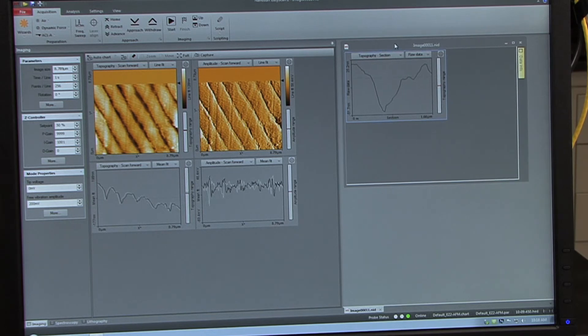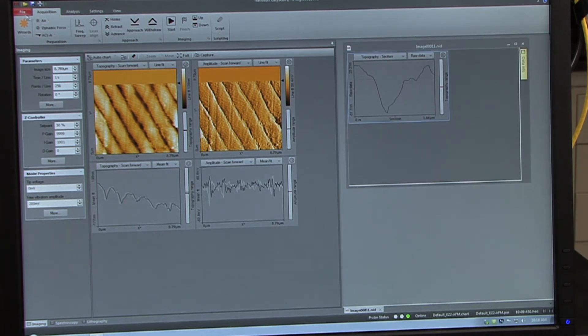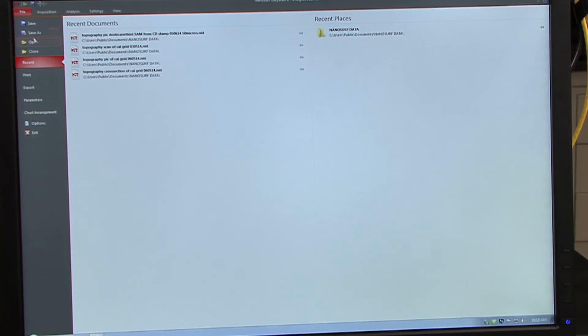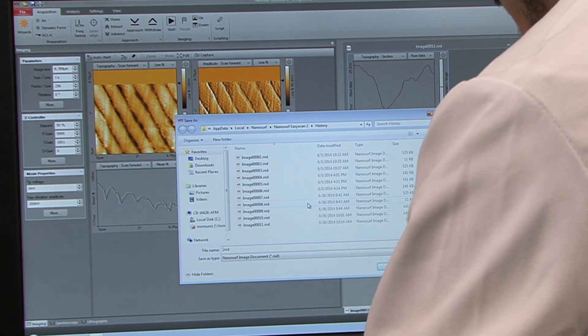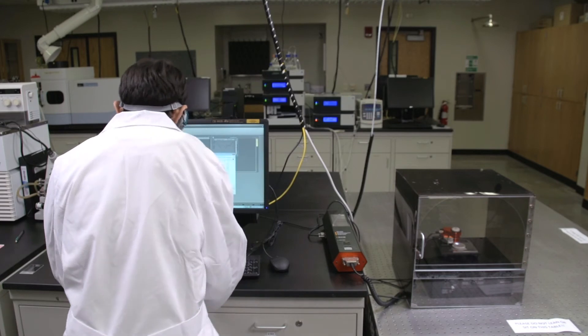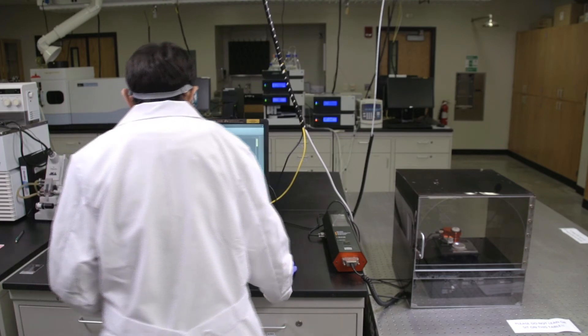Once you've obtained the cross sectional image, you'll want to go to file, save as, and title the NID file based on the particular alkane thiol you've imaged. And click save.